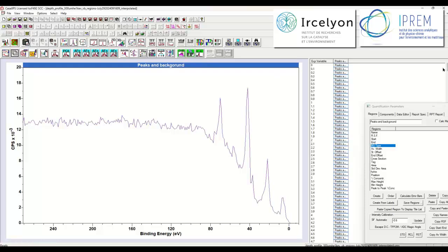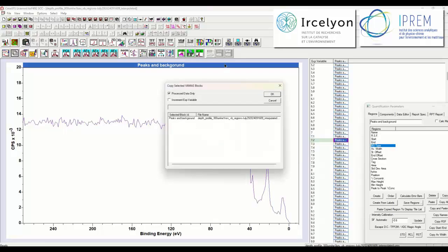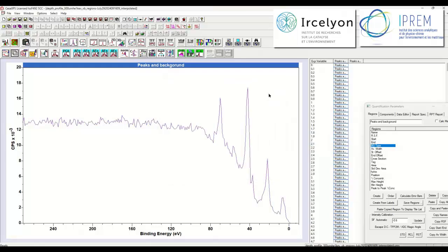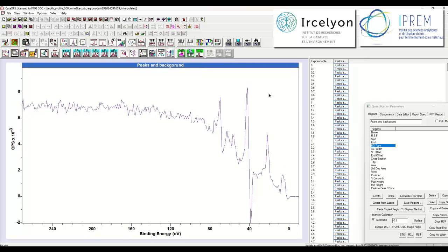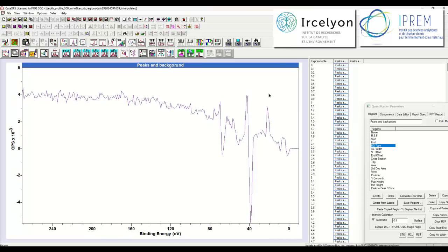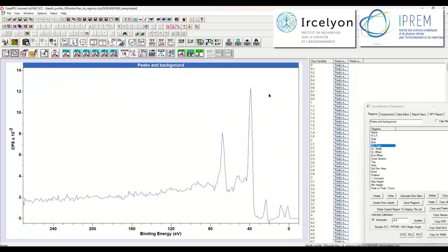So I've just moved down the list, not too far, but I've gone down the list, so I've subtracted a bit of the end of that sequence from the first in that sequence, and I'll accept that as my first component spectrum that I will use in a least squares analysis of these data. So let's carry on down the list, and you can see that the consequence of subtracting more and more of the second or the end spectrum in that list from the first in the list is that we are producing a shape that looks much more like a reduced form of the material.